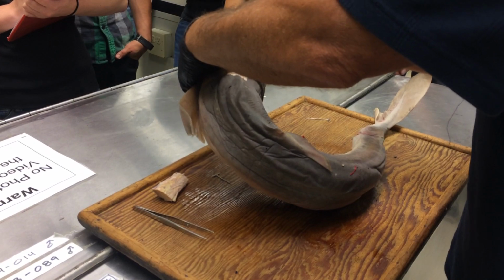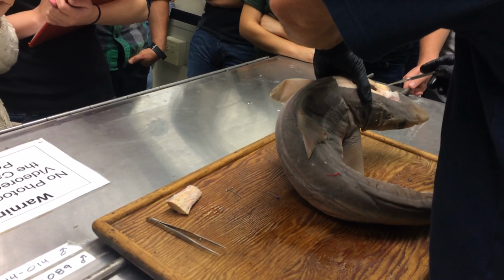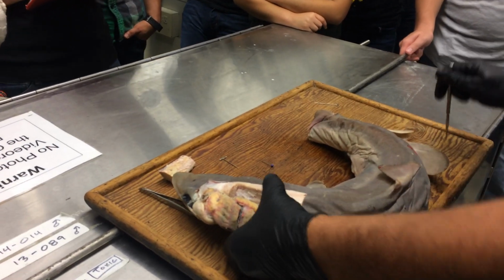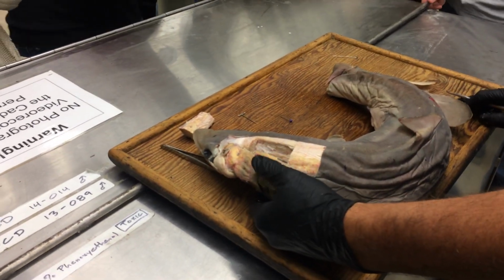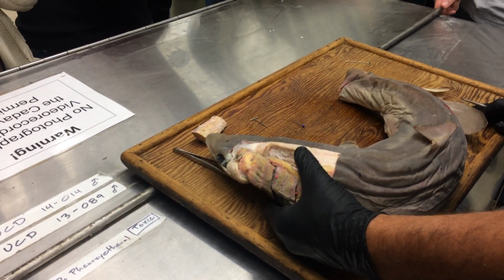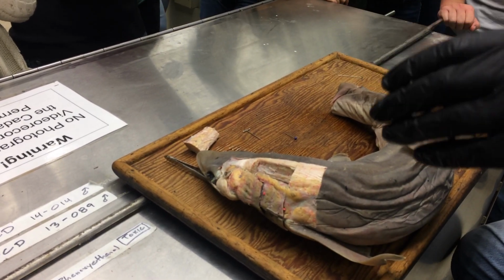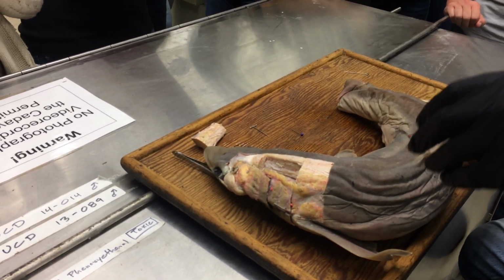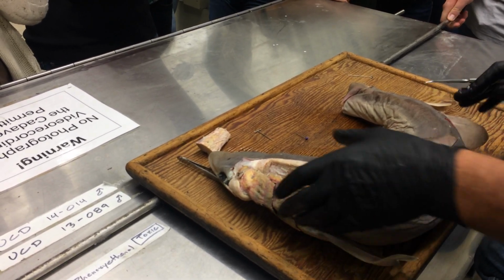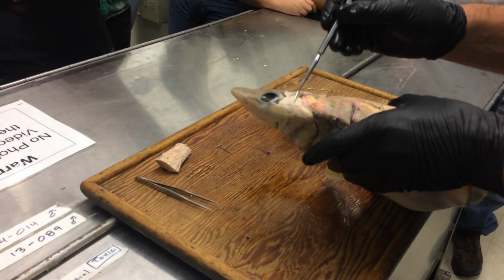Here, this guy. And that would be the adductor mandibuli. Okay, everyone likes that one. And did I mention last time that that's sometimes used for fake scallops? Yeah, they take it from sharks and they slice it because it's kind of round, and they slice it up and make these little round things that look kind of like scallops and put sugar water in them to make them taste sweet and scallop-like. Anyway, so that's the adductor mandibuli there.